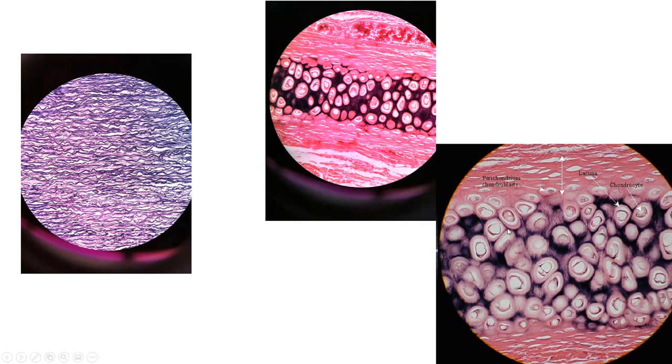Moving into cartilage, this is elastic cartilage. This is probably a better view of it because you should be able to actually see the elastic fibers. Big places we have it are going to be the external ear and also the epiglottis. So, elastic cartilage.